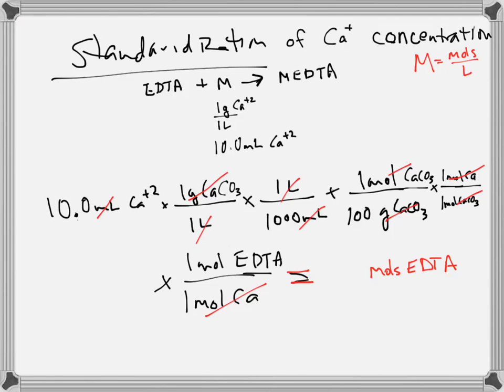So you added some volume from your experiment. Okay? Divided by the volume. I can't spell. It's fighting me all the way through. Volume added from burette. I think there's too many letters in that word, but okay.